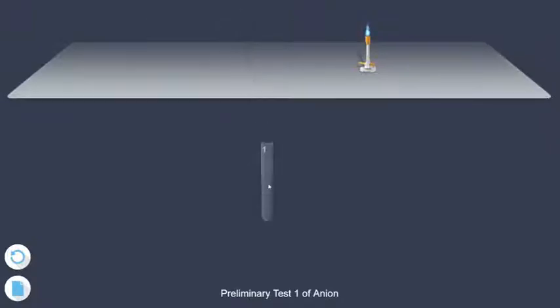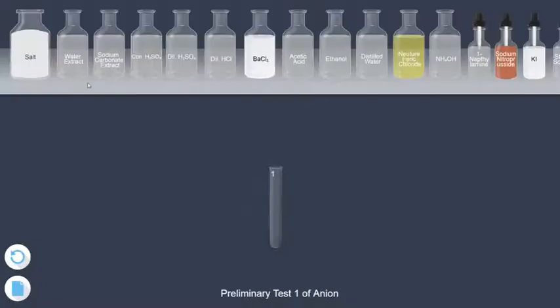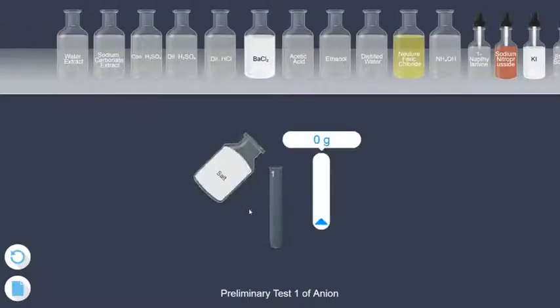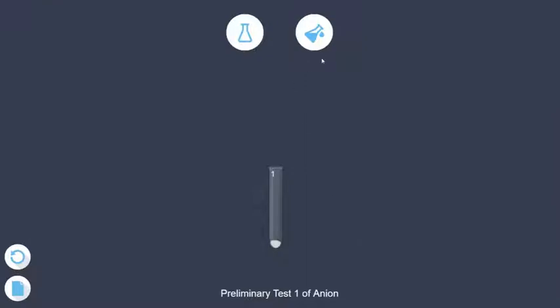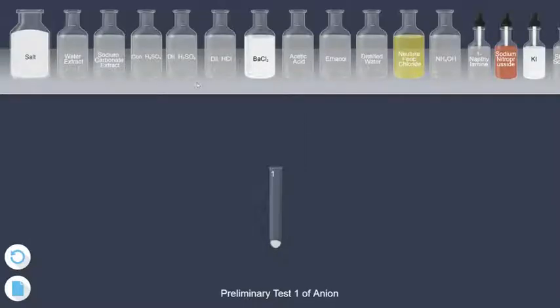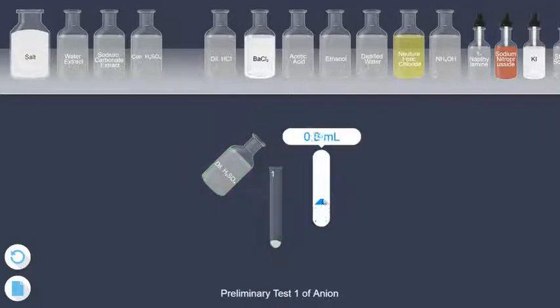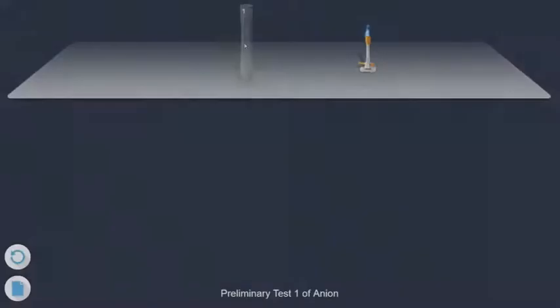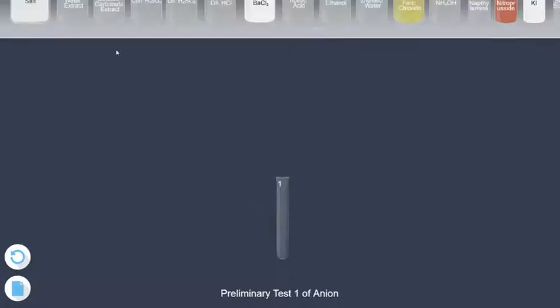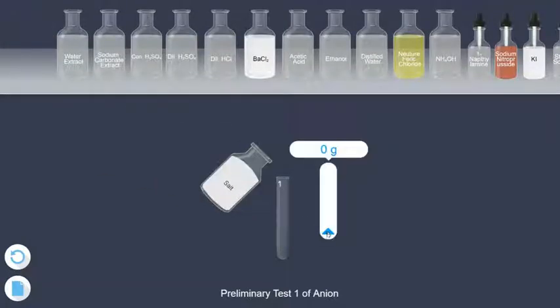Click and drag the apparatus to Workspace. Click a suitable chemical component and drag it on the test tube to pour. If the chosen solution is correct, then the system will show green color and allow you to pour the content, otherwise it will show red. In order to choose the exact quantity of compound or solution, drag and leave the slider to pour.